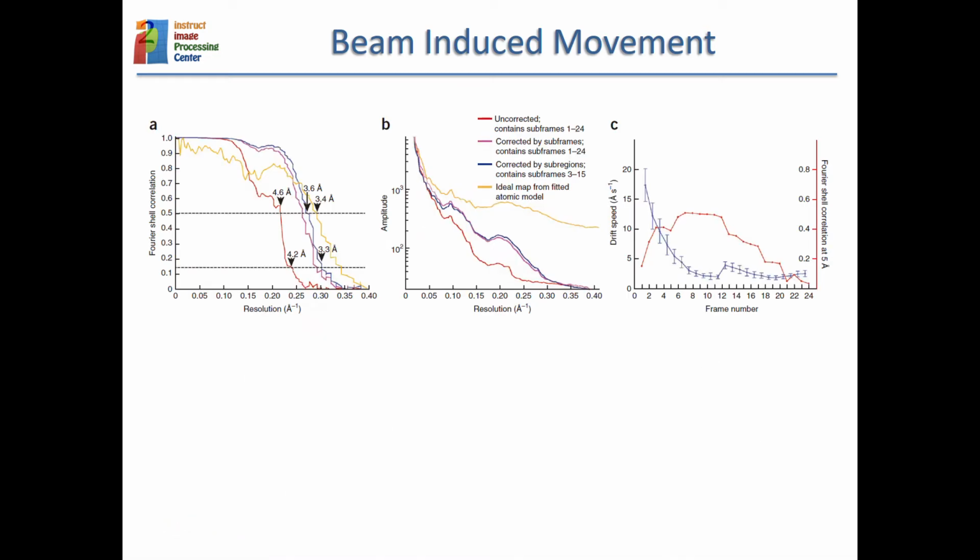There is also a debate of which are the frames that we should use for 3D reconstruction. So, for instance, I may choose all of the frames, or I may use only the ones from 3 to 15, or just the first ones. So that is really a lot of possibilities, and maybe this debate was a few years ago, but now things are solved in a different way, I would say.